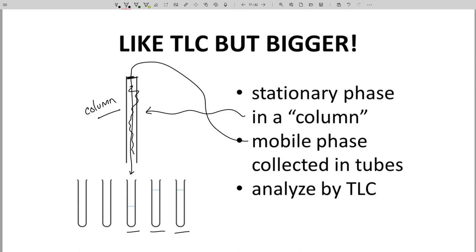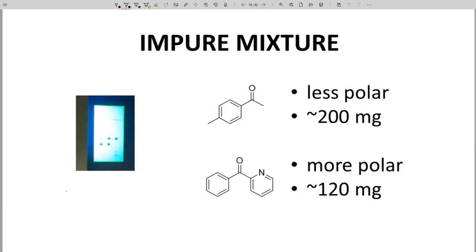You can see what is in each fraction by running a TLC. Here on the left is an image of the TLC plate of an impure mixture. The two components are shown to the right. The top compound is less polar, and it corresponds to the top spot. The bottom compound is more polar, and it corresponds to the lower spot.